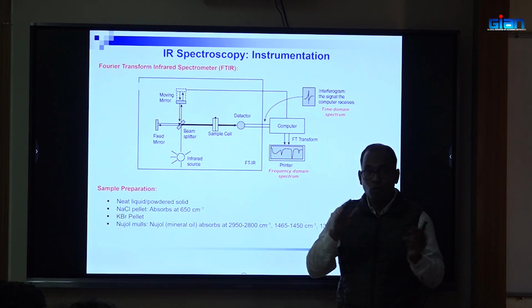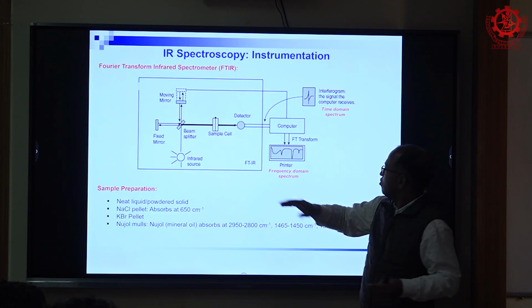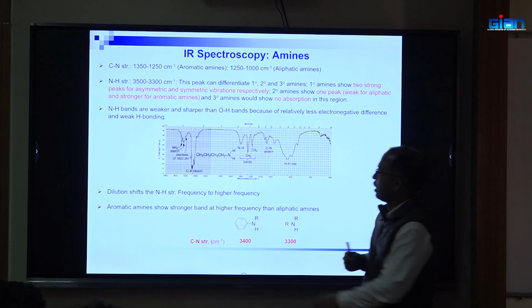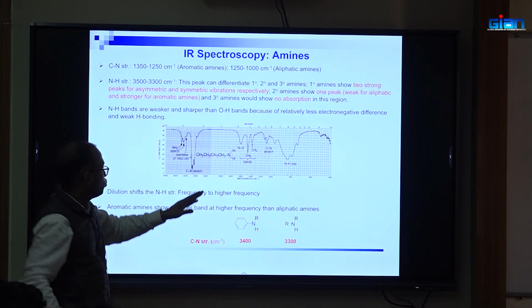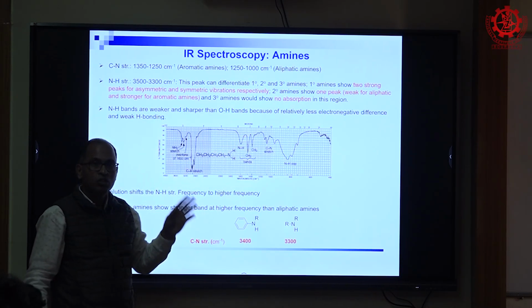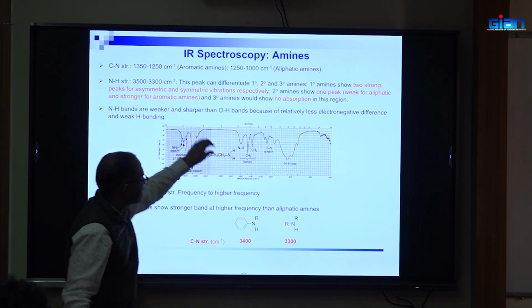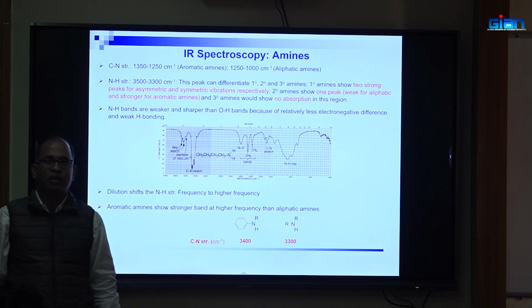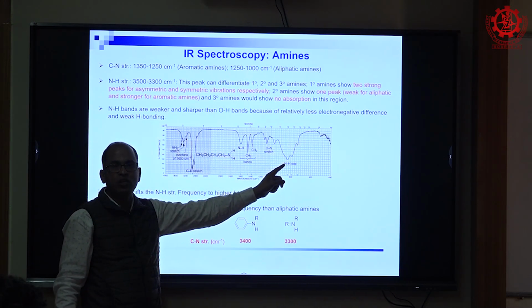But when you give 400 to 4000, what will happen? Let's go to one compound peak. Now we are giving 400 to 4000 at once. So this molecule will absorb, this part will absorb, this part will absorb, all of this. When the detector looks, it will just find the rest. Now this Fourier transform is a mathematical expression that will find out the individual energies absorbed.